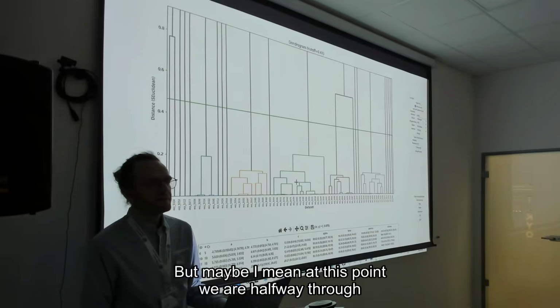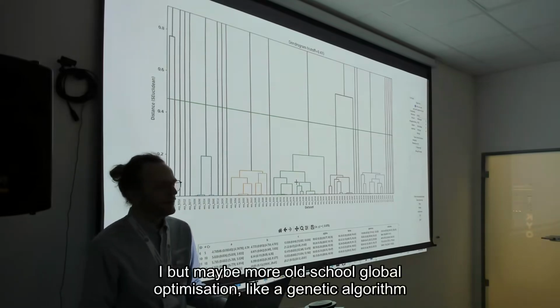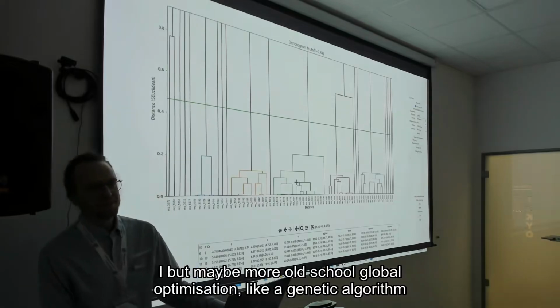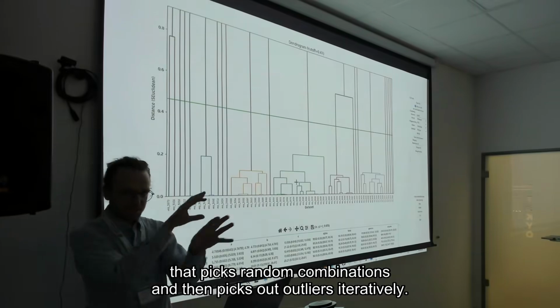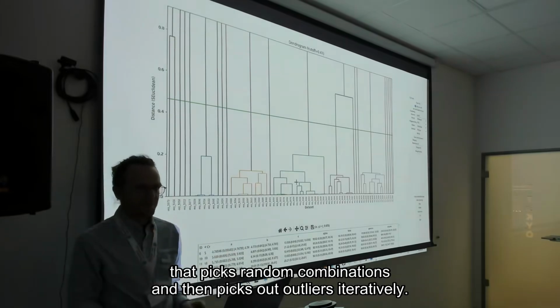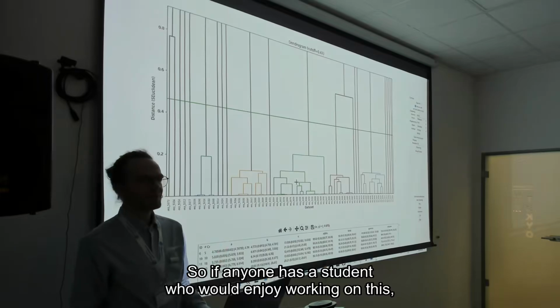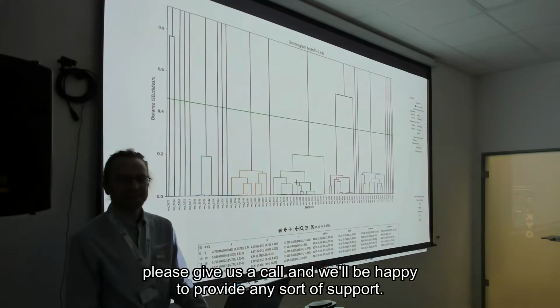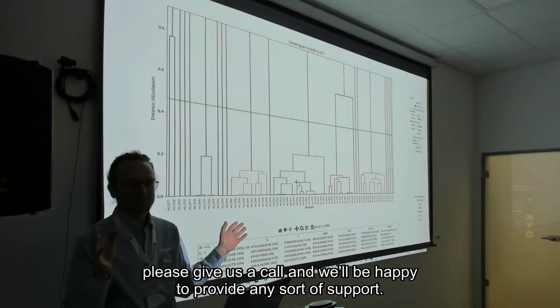along the lines of a genetic algorithm. Okay. But maybe, I mean, at this point we're halfway to AI. But maybe more old-school global optimization, like a genetic algorithm that picks random combinations and then kicks out outliers iteratively. So if anyone has a student who would enjoy working on this, please give us a call and we'll be happy to provide any sort of support.